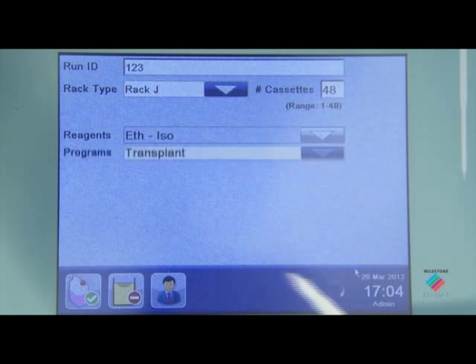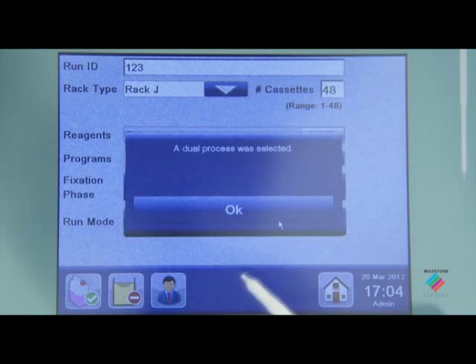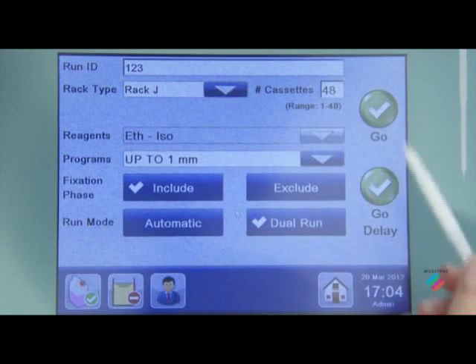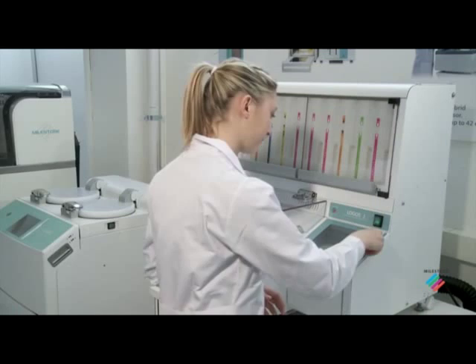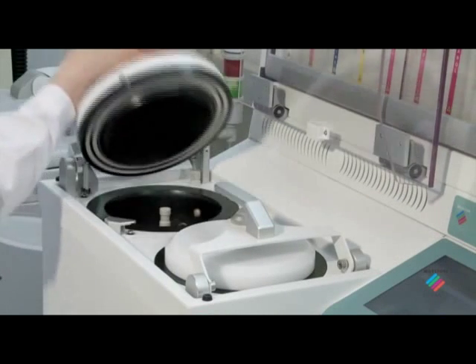The Logos J can operate as a single batch fully automated or as a sequential dual retort tissue processor, either with microwave or resistive heating mode, thanks to its innovative patented hybrid technology.